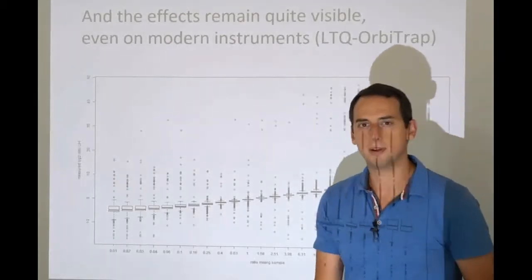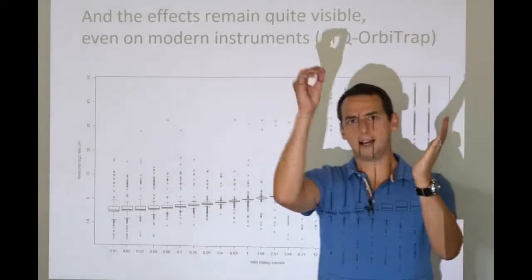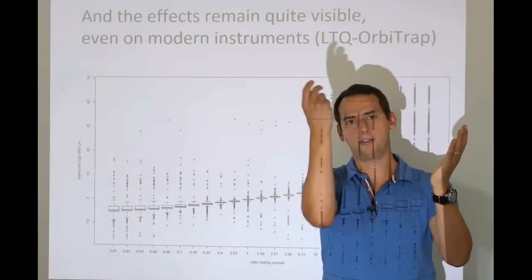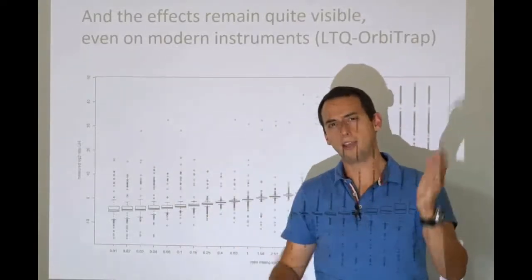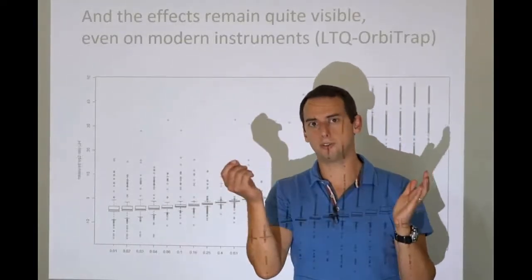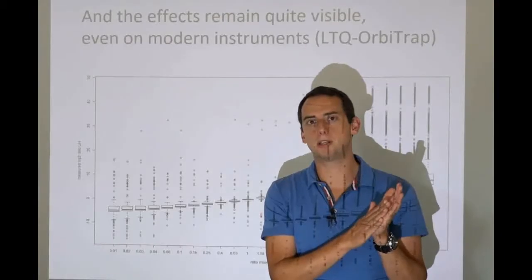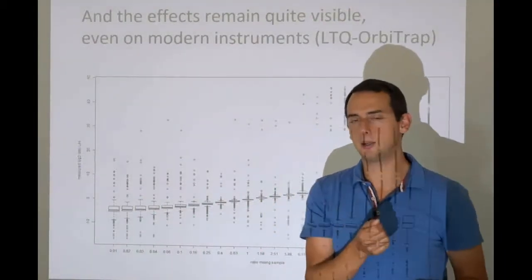I'll tell you one more thing about a detector, which is funny. Remember that you had this electrode, and then the ion hits it, and then things fly off, and they result in more things flying off, and so forth. You could wonder, can this plate continue to have things fly off of it? Because at some point the plate must become depleted. There should be nothing left to fly off the plate, and that's exactly what happens.